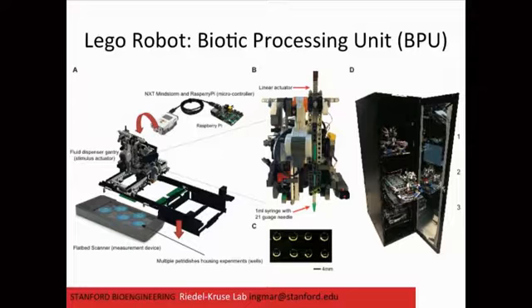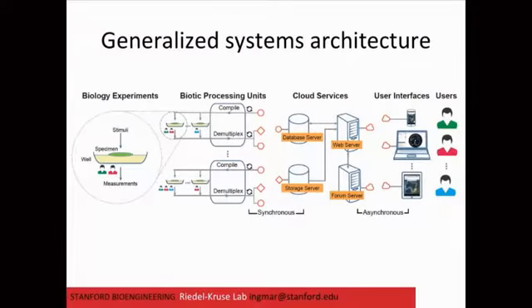So again, this is the robot. This is basically the pipetter, which is all made out of Lego except a normal syringe, so it's pretty low cost. And here is basically a standard server rack where we have 3 such machines, each of them having six of such dishes, which is important for us just to try to understand the technology. If you have multiple machines in parallel, each with multiple experiments, how do you route and synchronize all of that? That's actually what this schematic is showing here.